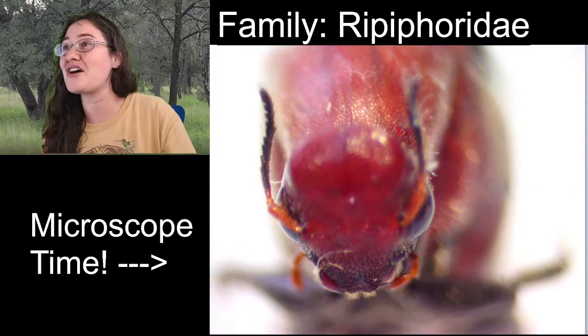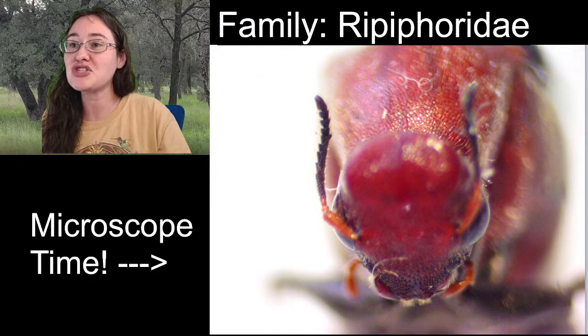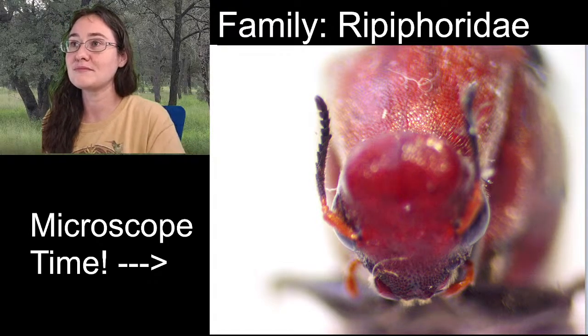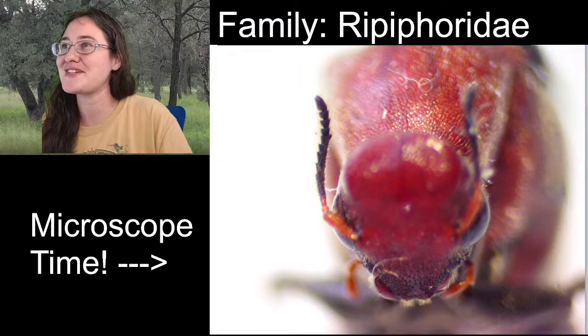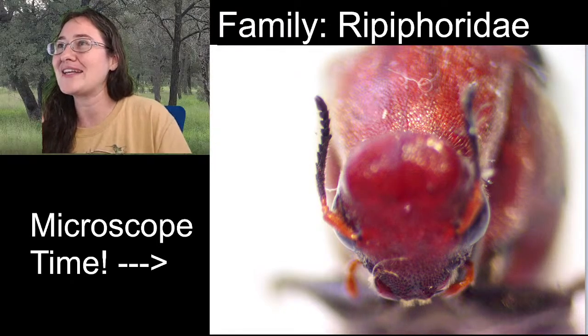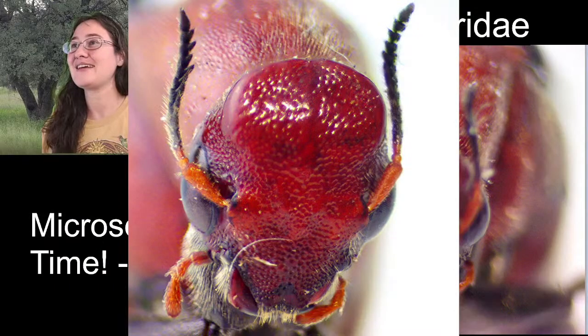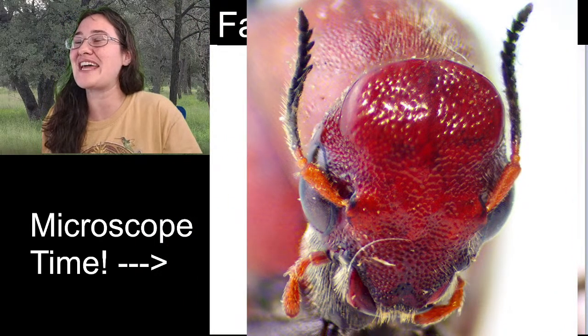I know that I already have a good microscope image of this beetle head on, so let me just go ahead and add it to the live stream really quick. I've been taking decent microscope images, and it's been a whole lot of fun stacking them. There we go. That is what this beetle looks like head on.